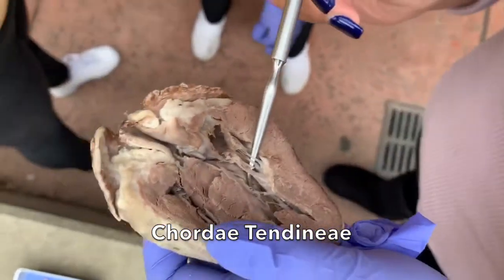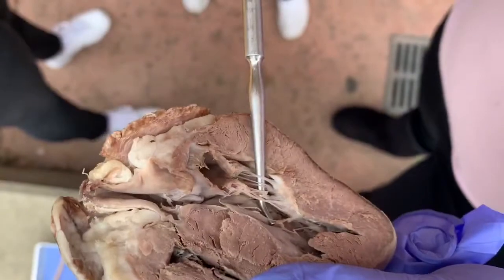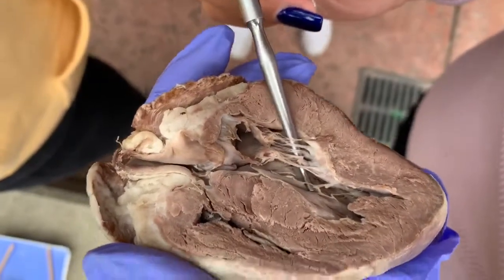So the chordae tendineae are very tough heartstrings of the heart, and they're connected to the papillary muscles, and they play a vital role in holding the tricuspid and mitral valves together when the heart is pumping blood.